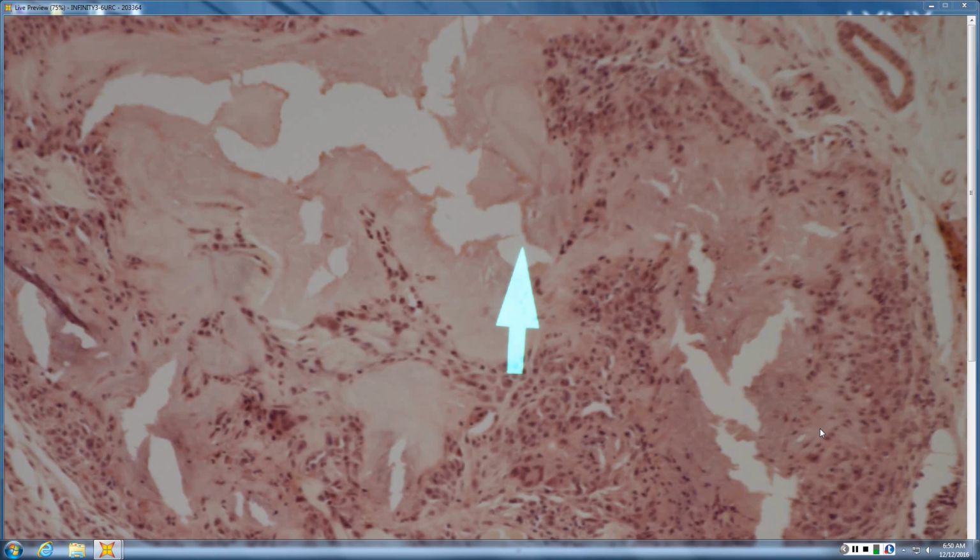Or you can send it to us in saline and say, "Gout, please, pretty sure it's gout, please fix in alcohol." Okay. And that actually preserves the crystals. So we just do it without the formalin. And they're actually kind of cool.